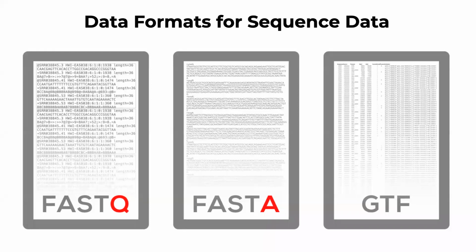The FASTQ file contains individual reads, those reads can be of various lengths and different qualities, and that is included in the FASTQ format. The FASTA format is typically used for the reference genome. So for example, we might have whole sequences of nucleotides, and those represent chromosomes or specific portions of those chromosomes if we're dealing with non-model organisms, and sometimes it could also be used to store sequences of proteins, not in nucleotides, but in amino acids.